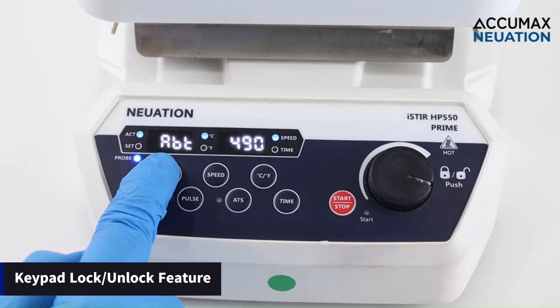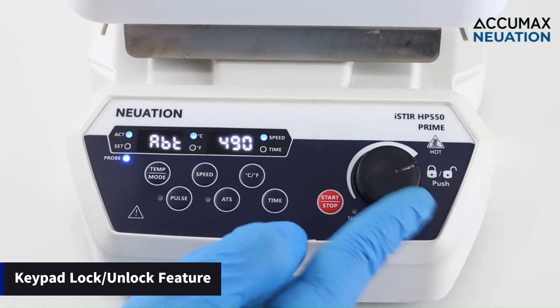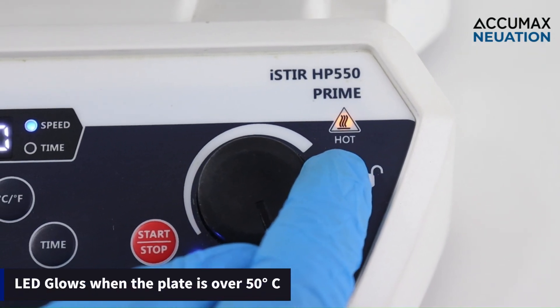It also features a warning light that activates when the top surface temperature exceeds 50 degrees Celsius. This vital feature ensures added safety particularly after an experiment is completed and the instrument is halted, preventing accidental contact.